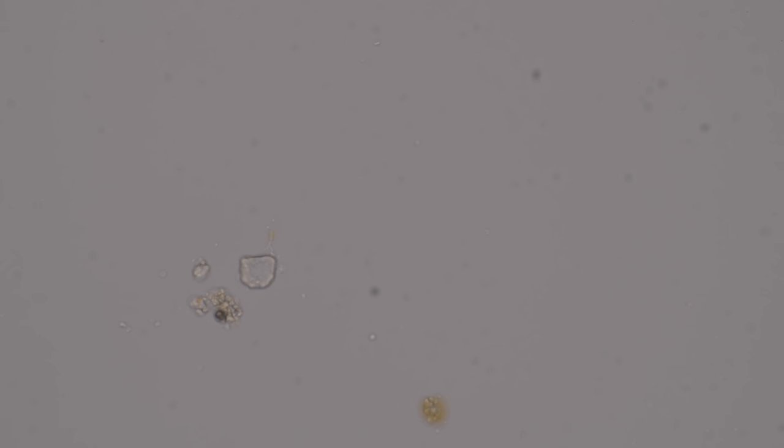All right, so let's switch over to the MSR Guardian filtered slide. Yeah, there's our water line for the slide. So that's definitely the inside of the slide. I just don't see anything moving. Top of the slide, or slip cover for the slide, inside of the slide. Again, slip cover, slide itself.